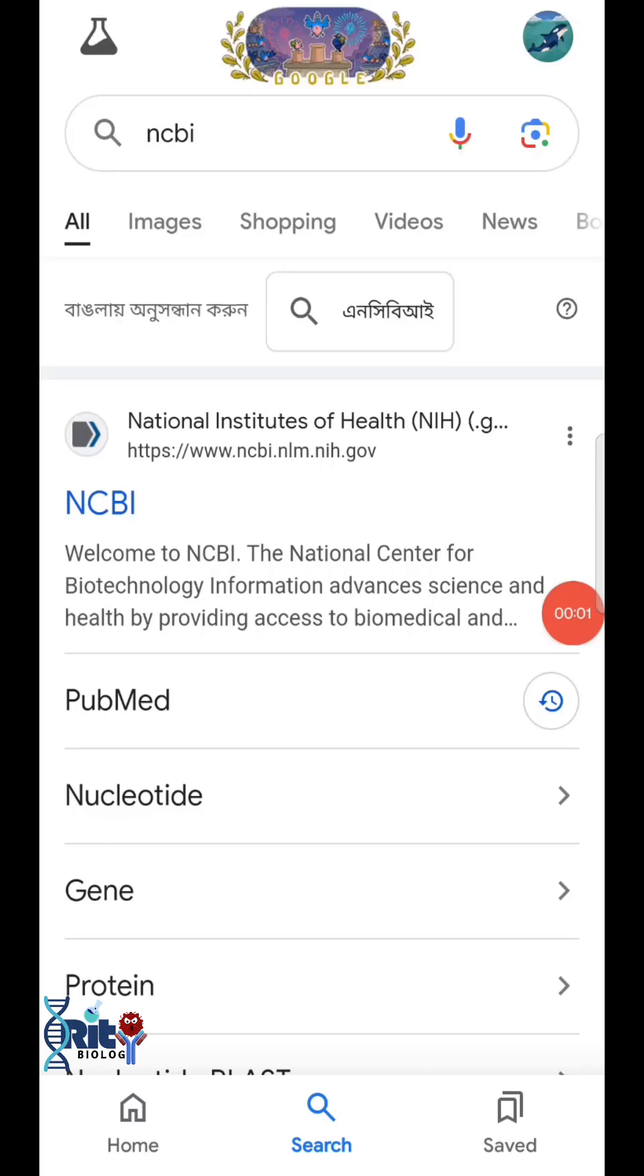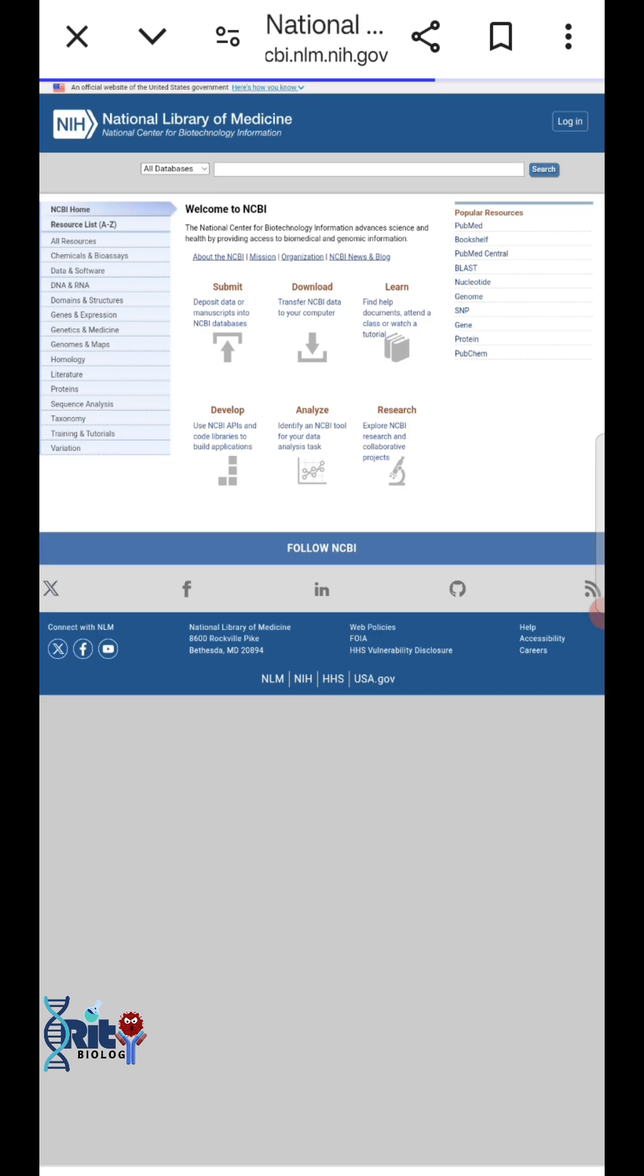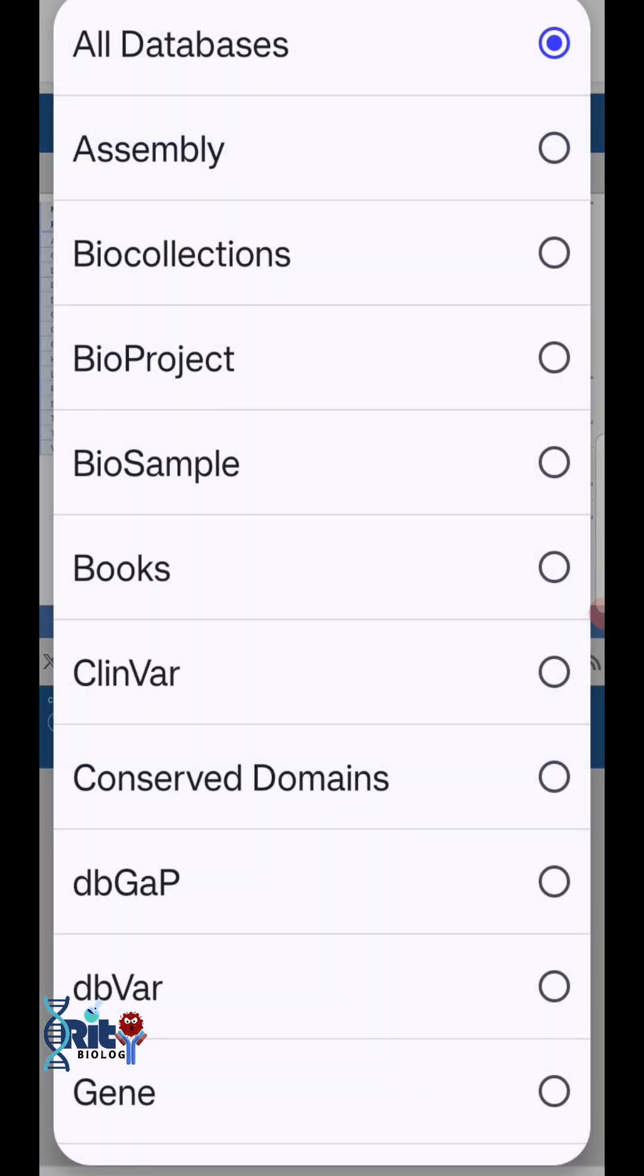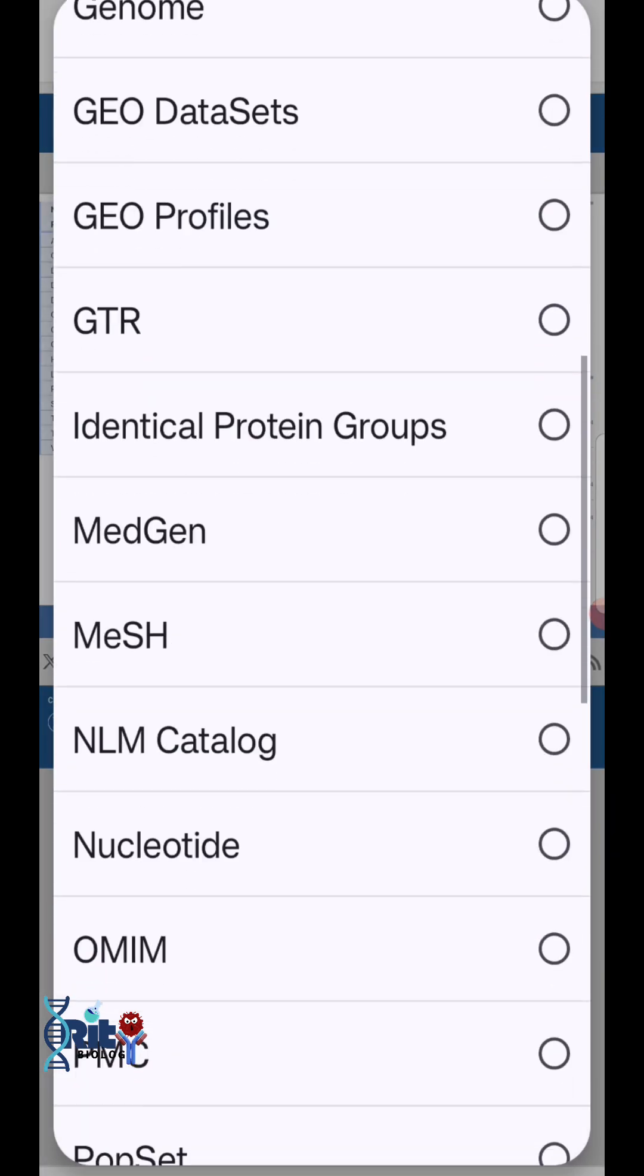Hello everyone, in this video you're going to learn how to find and copy protein sequences from the NCBI website. First, go to the NCBI website. Then in all databases, choose protein.